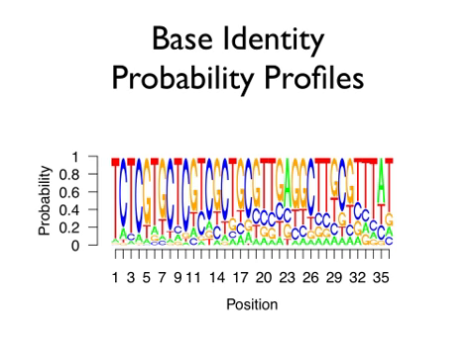And if you look closely, there will be some, like, what's a good example here? Anybody see one where you have 2 letters that are about the same size? 29, right? For 29, no, one a little bit more, no? 30, that's 31. For 31, G and T are almost the same.